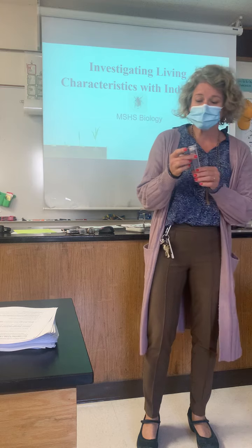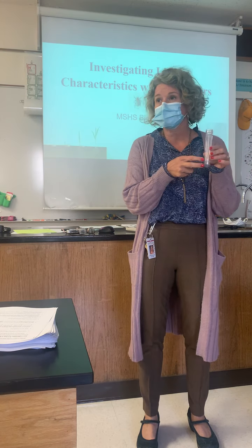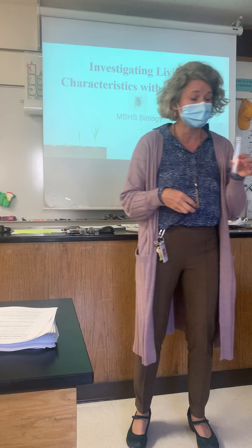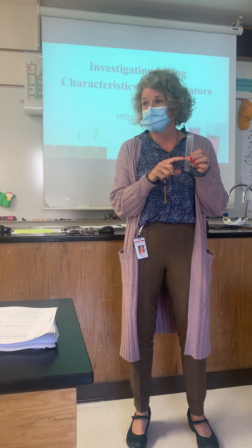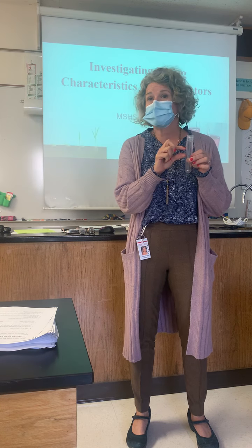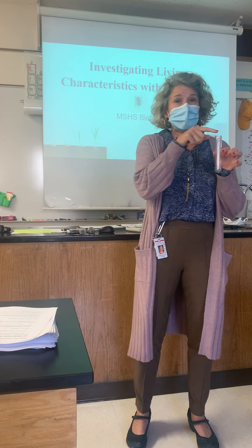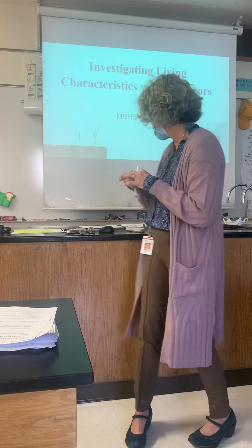Okay. So in your test tube, we're going to fill the bottom with something called phenol red. That phenol red is an indicator, and we'll talk about that more in just a sec. And then above the liquid indicator, we're going to put a piece of foam, so that the foam will be suspended in the middle of the test tube. And then on top of that foam, we're going to put 3 things.